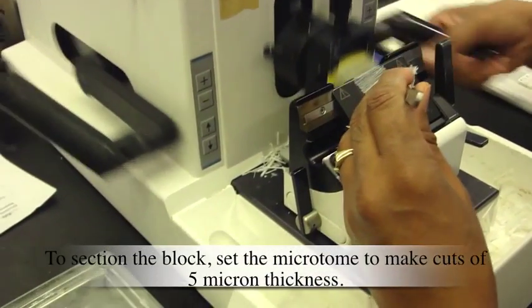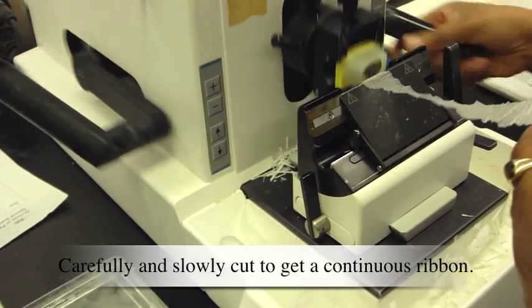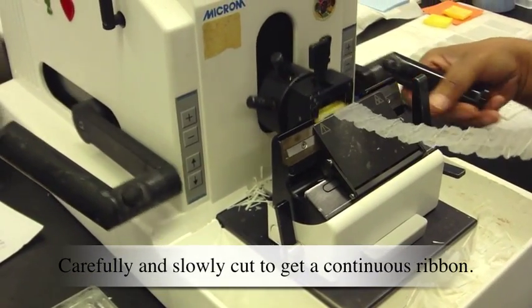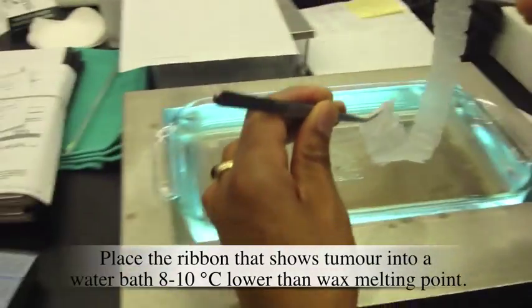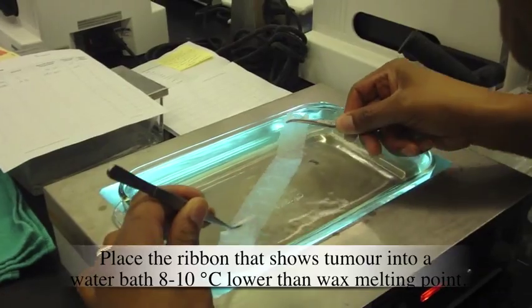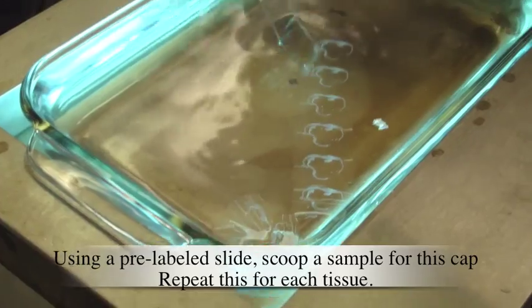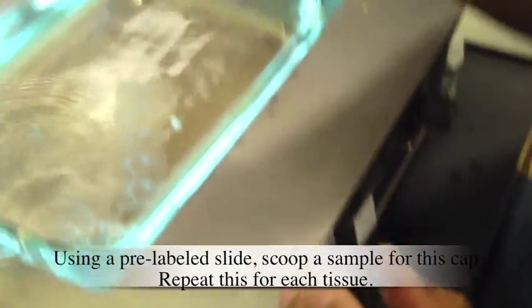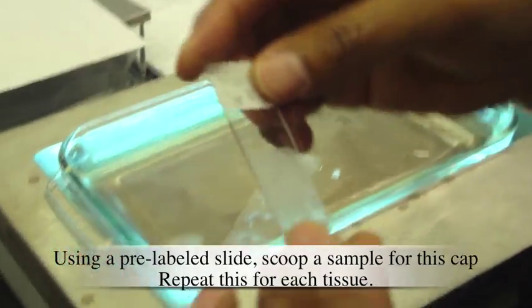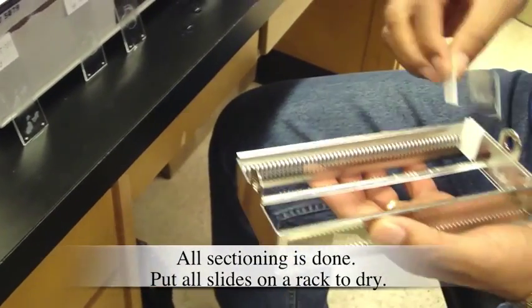To section the block, set the microtome to make cuts of 5 micron thickness. Carefully and slowly cut to get a continuous ribbon. Place the ribbon that shows tumor into a water bath 8 to 10 degrees Celsius lower than the wax melting point. Using a pre-labeled slide, scoop a sample for this cap. Repeat this for each tissue. All sectioning is done — put all slides on a rack to dry.